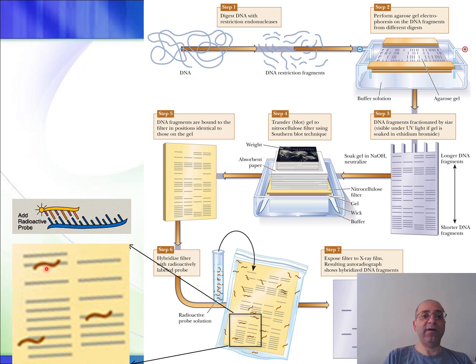Okay, so you'll have the probe bound here, here, and here, but not to the other DNA fragments, because they do not contain a sequence that is complementary to the probe. Great. Then we wash away all of the non-bound DNA. Okay, my picture is covering this, but it doesn't matter. Okay, so you get the idea, I hope.